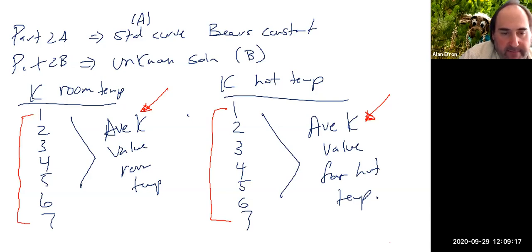You will, as we talked about, need to write a formal lab report for this one, and it will need to include a completed ICE table for part 2 here. So again, you'll need to work out one of those as part of your lab report, as that's a sample calculation with actual numbers. Any questions or anything like that? Again, you need to have notebook pages like we talked about with procedure, observations, all that kind of stuff. And you need to work on those things. So again, there's a lot of data analysis that you have to do here. Do not wait to the last minute for sure.